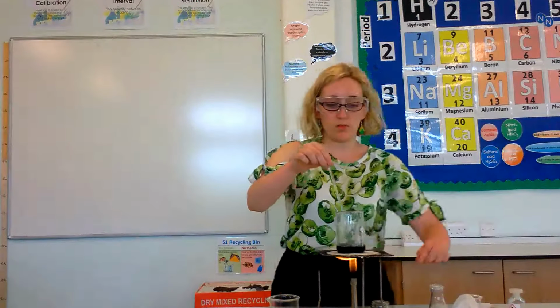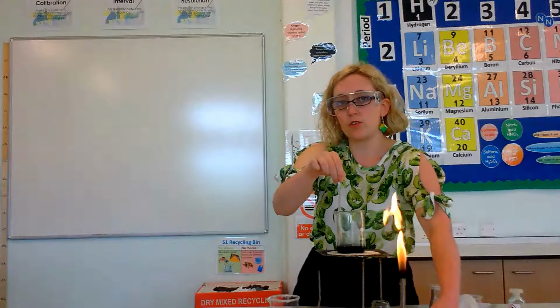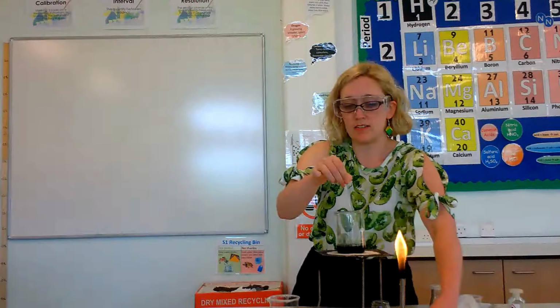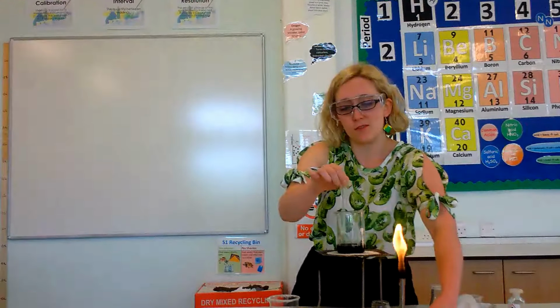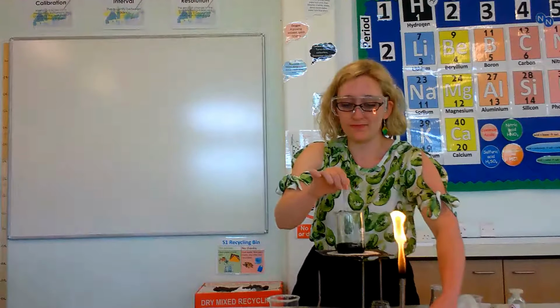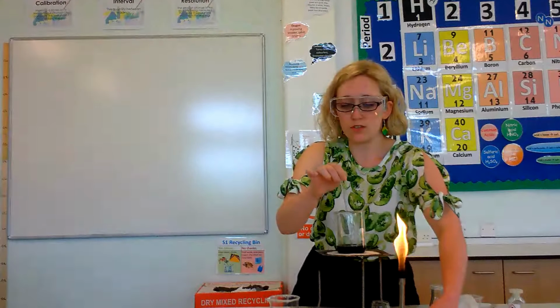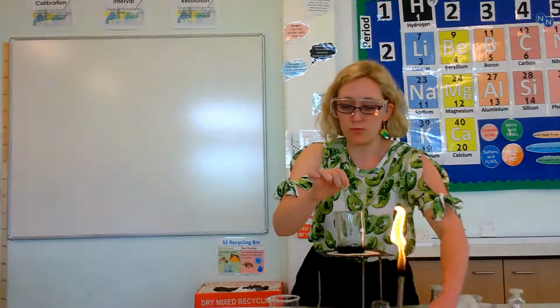My acid is starting to boil, so what I'm going to do is move my Bunsen burner away. You see I've got it on the yellow flame here. I don't want to heat it up too much, because if this acid spits, that's not a good thing, because it will be spitting all over your face, all over your clothes, then you'll be covered in acid, which nobody wants. Okay, so this has been really, really hot now. It's still got some undissolved copper oxide, so now I know that there is no more sulfuric acid in there. It's all reacted with the copper oxide.